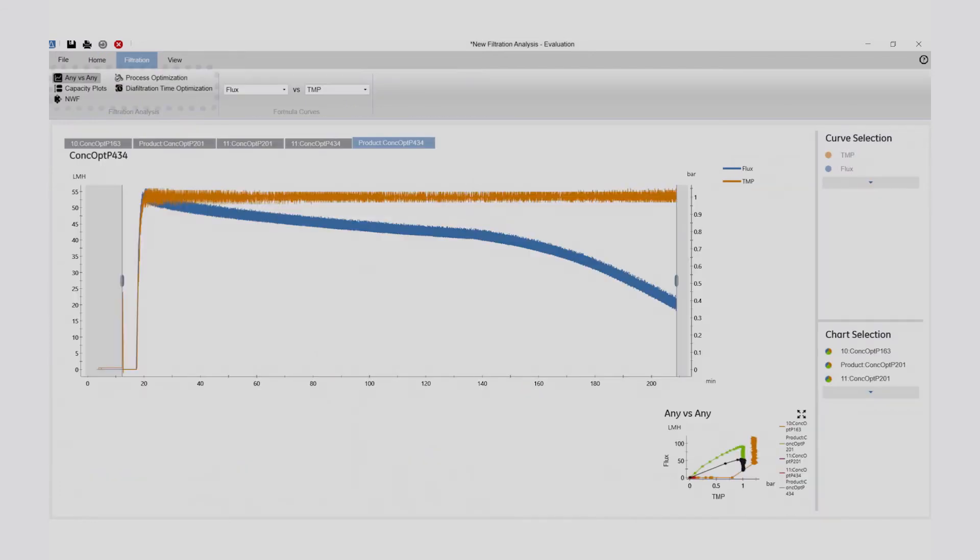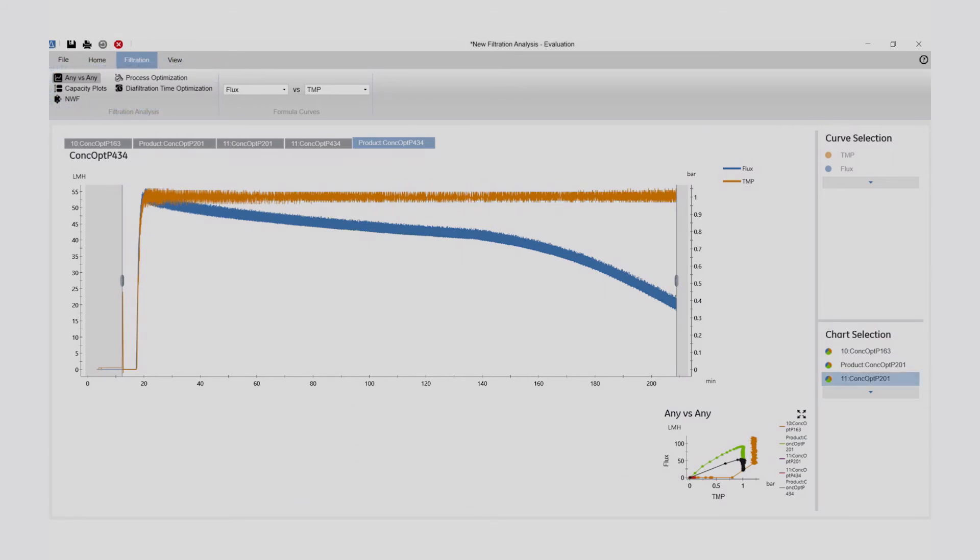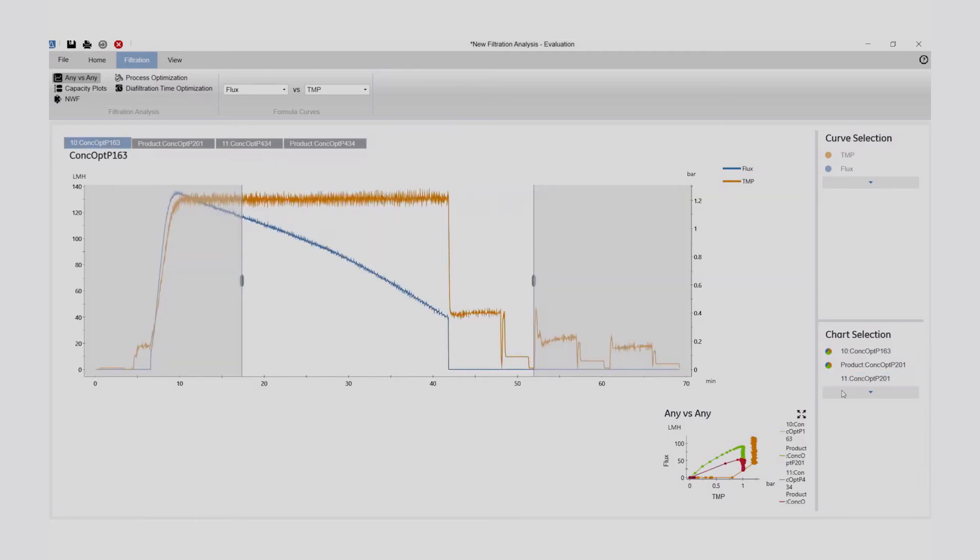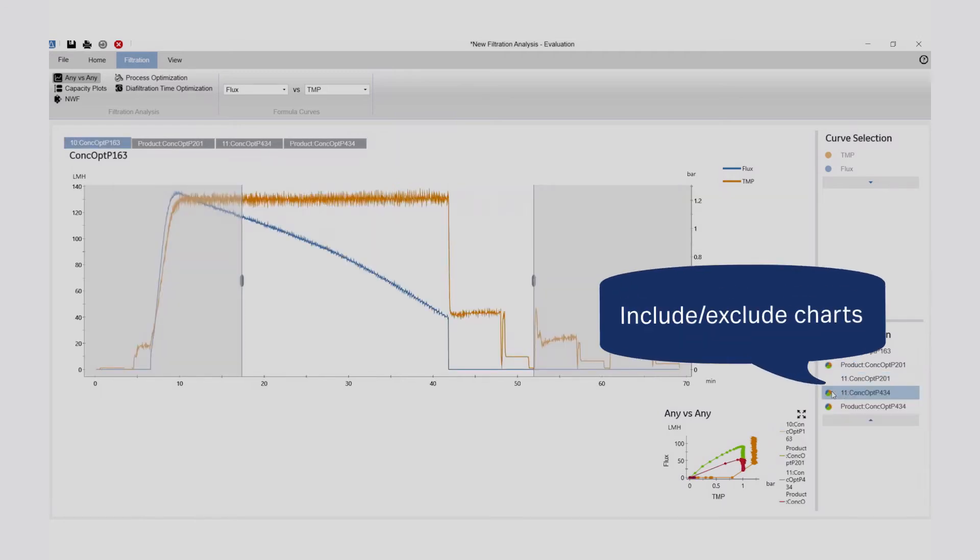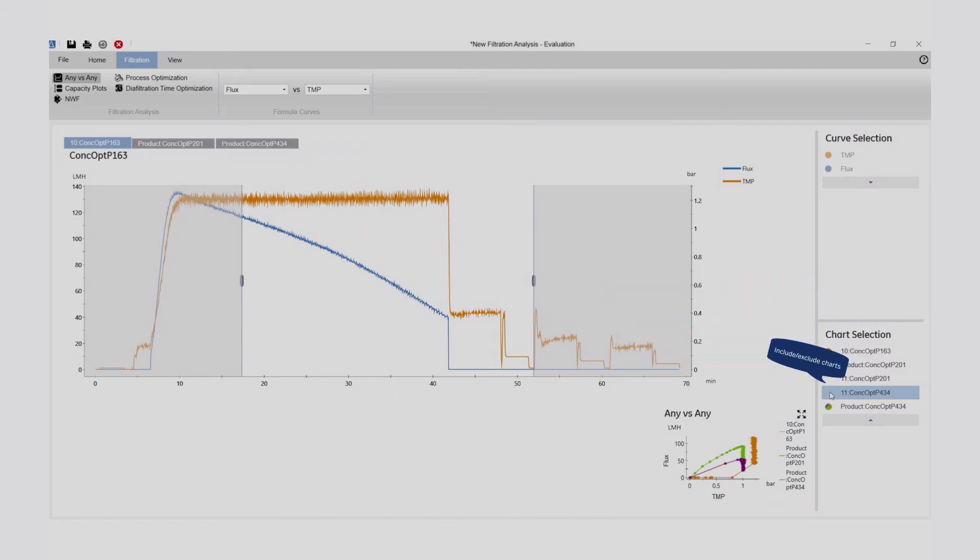The Any vs. Any algorithm will be applied to the selected results by default. Here, the Any vs. Any algorithm is used to analyze the change in flux due to increasing concentration factor. Charts can be included and excluded for analysis from the chart selection pane.